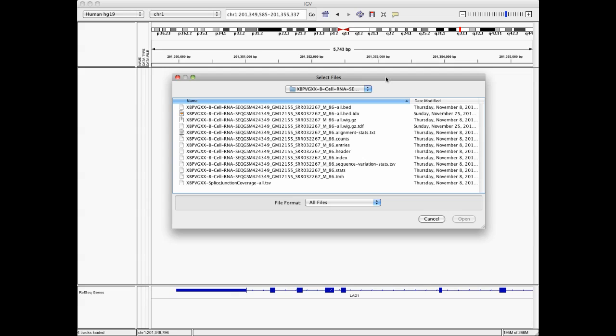First, we will look at alignments. We'll assume that the alignment analysis has been carried out in GobyWeb. For more information, please look at the tutorial on alignment. Secondly, we assume that all the associated alignment files have been downloaded. For more information on this, look at the tutorial online on how to download the alignments.